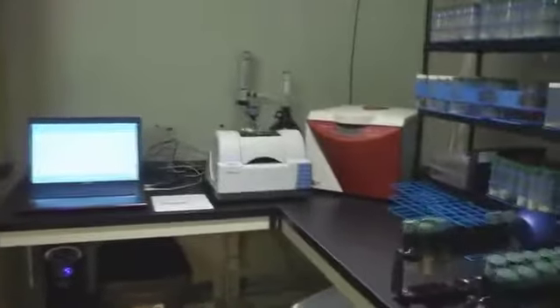At the Natural News Forensic Food Lab, this is what you're seeing. I'm going to explain to you today how I discovered tungsten in rice protein. But I wanted to show you some of the sweet new equipment that we have online here.